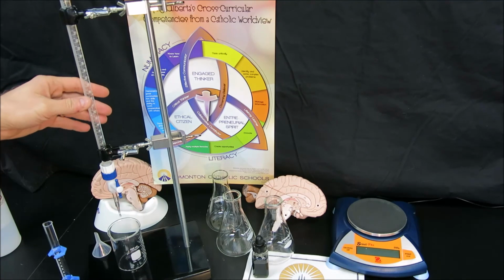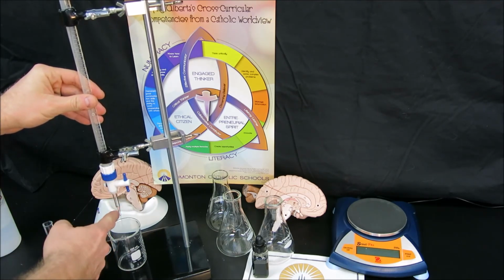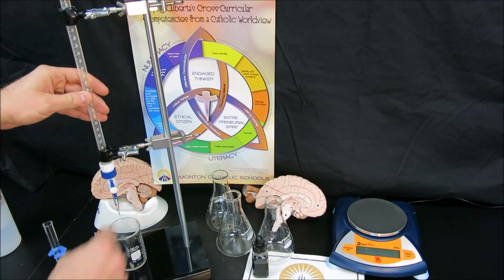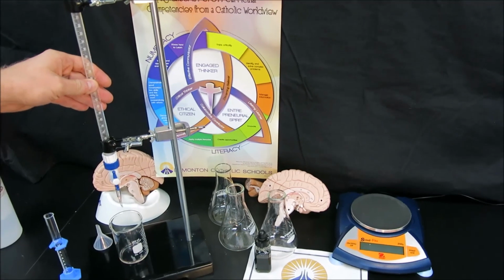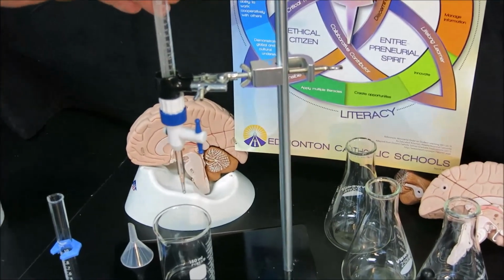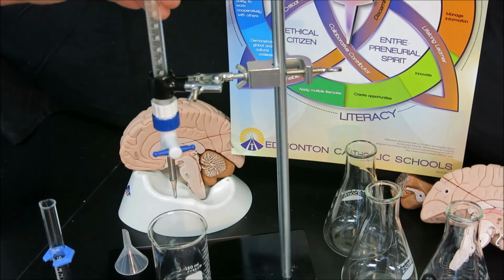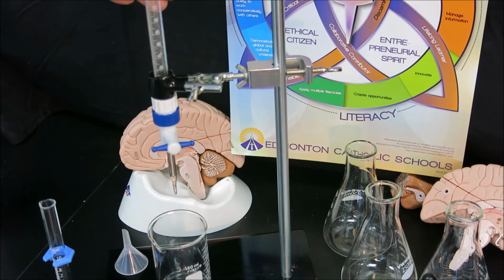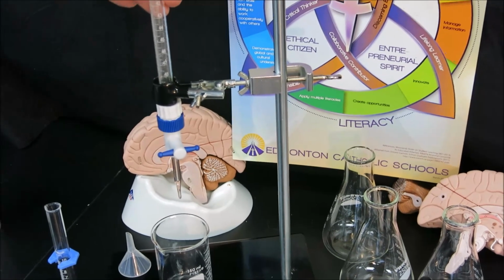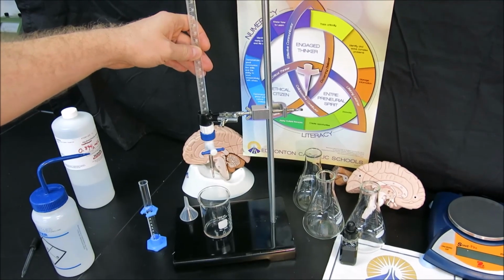You'll notice here that the burette has a stopcock to operate the flow, and when it is in its parallel position, the solution in the burette can flow out. When the stopcock is placed into a perpendicular position, the fluid in the burette will stop. In titration, that means that you need two hands in order to perform a successful titration.